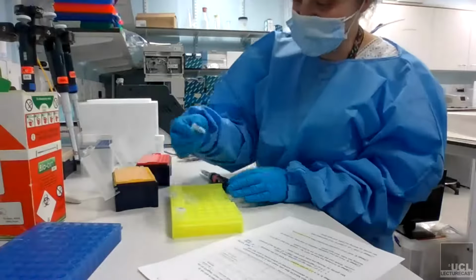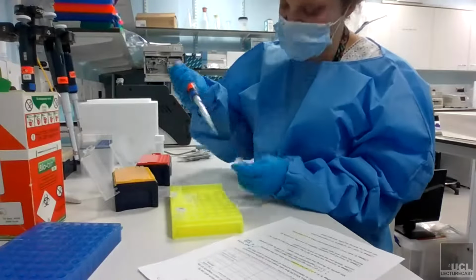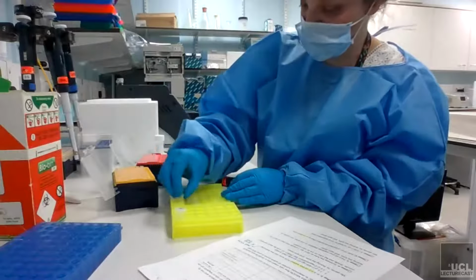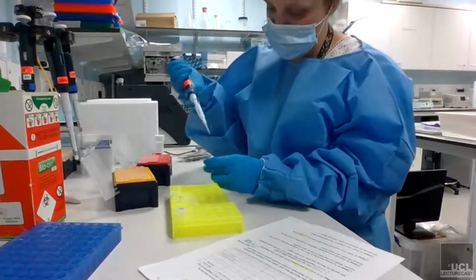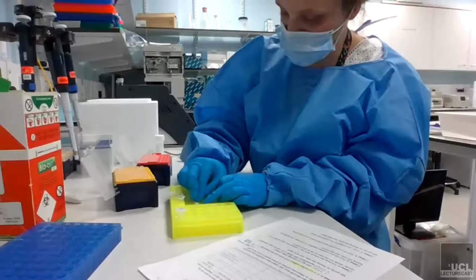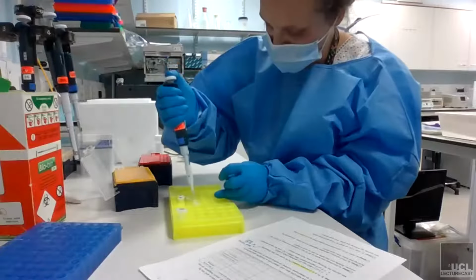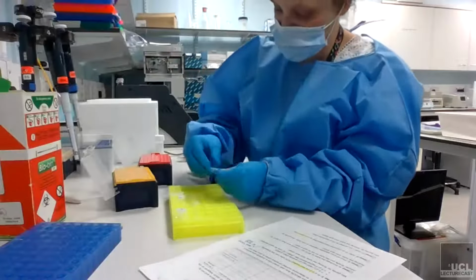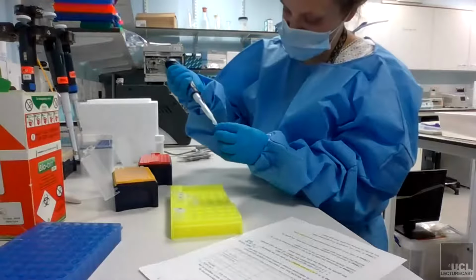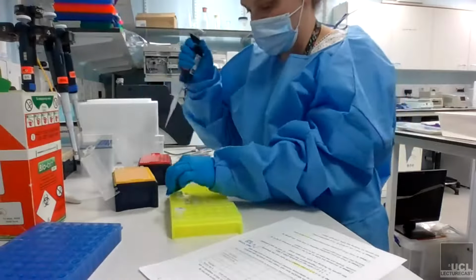Thank you, Isabel. So now I've added my water. I'm now going to add each of my samples. And obviously, it's really important at this stage that you don't cross-contaminate anything, because you need to barcode them all. So that's sample 1. Sample 2. Sample 3. Sample 4. And sample 5.